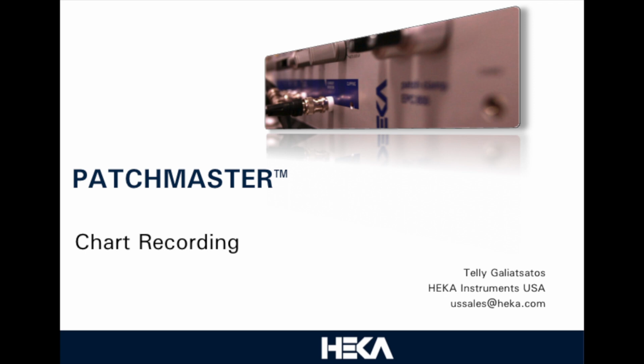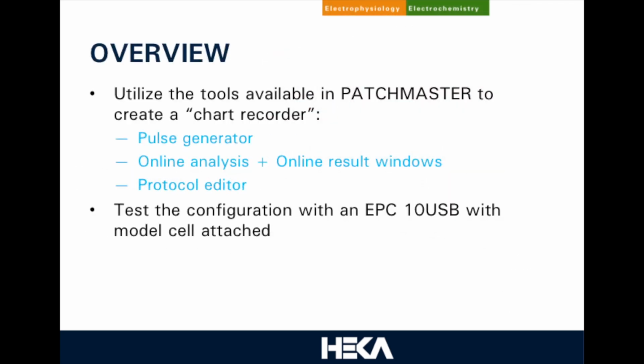The goal of my presentation today is to go through, step by step, the various settings required in the pulse generator, the online analysis, and the protocol editor, which will lead to a Patchmaster configuration that provides both a high-resolution acquisition and a lower-resolution chart recorder. I will be using the EPC10 USB to test the configuration with a model cell attached.